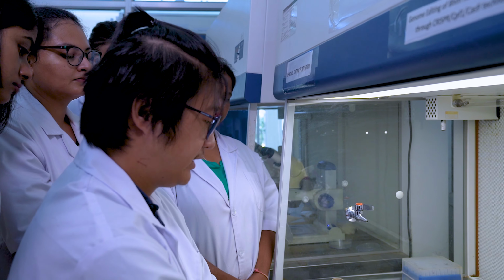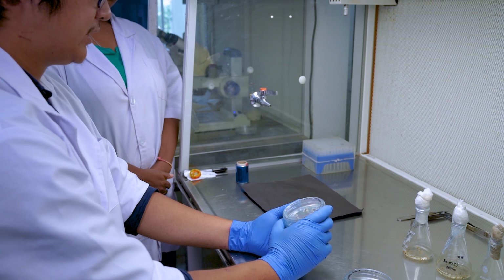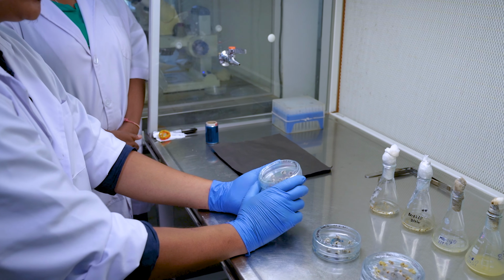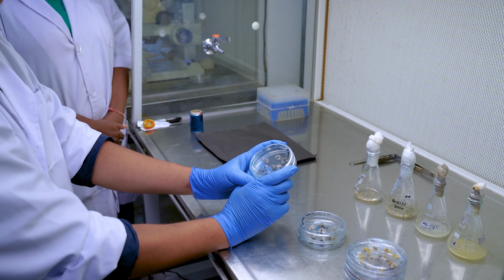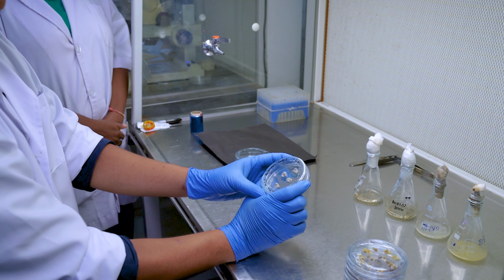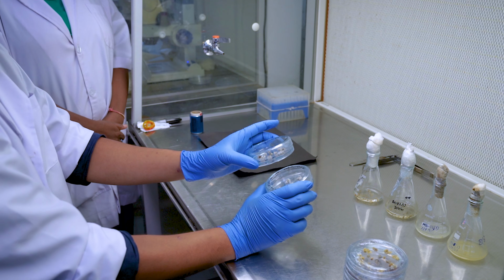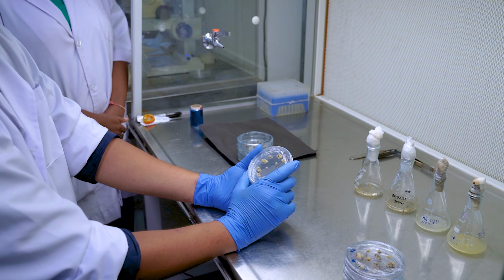After we inoculate the immature male flowers into the callus induction media, we will keep it for around 4 to 5 months with repeated subculturing. This one plate is after 3 months of subculturing, and this is 3 to 4 months after inoculation, which will give rise to our embryogenic callus.